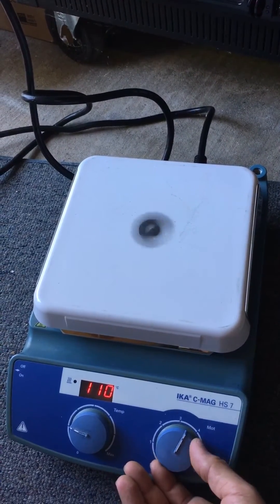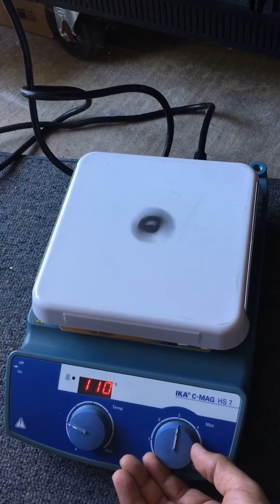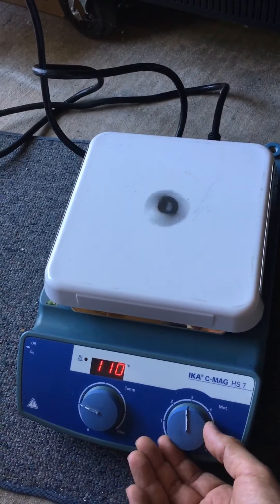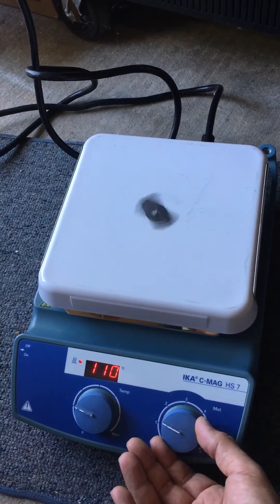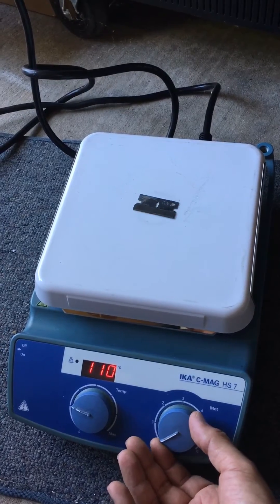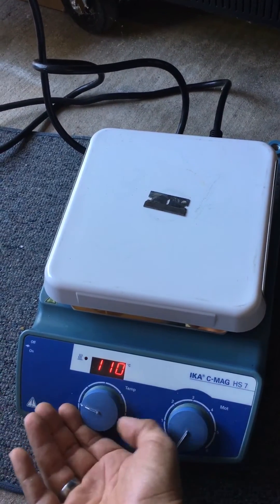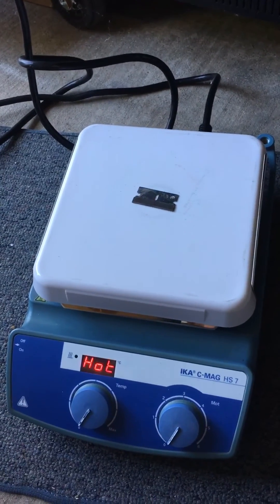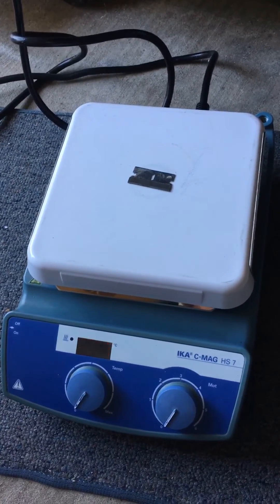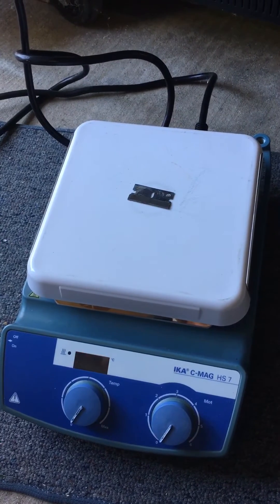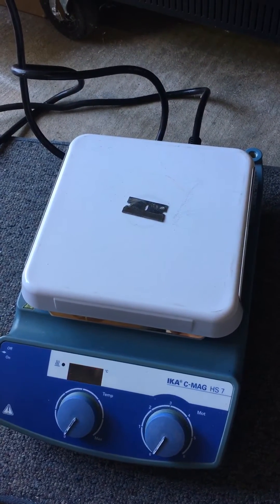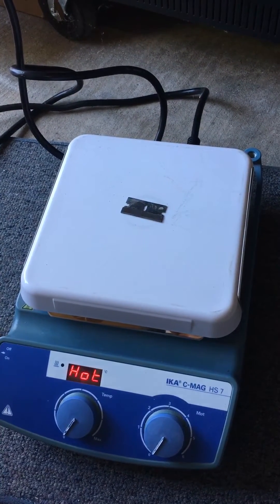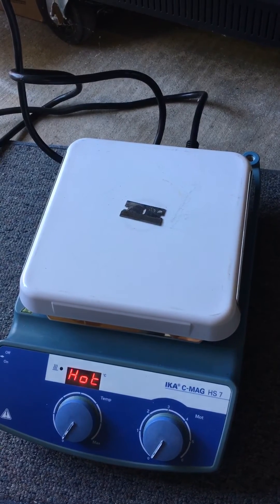I mean, stirrer IKA CMAG HS7 - that's the model. And we just wanted to show you how this works. Probably people that work in labs already know about this, but we have this for sale on our eBay store.